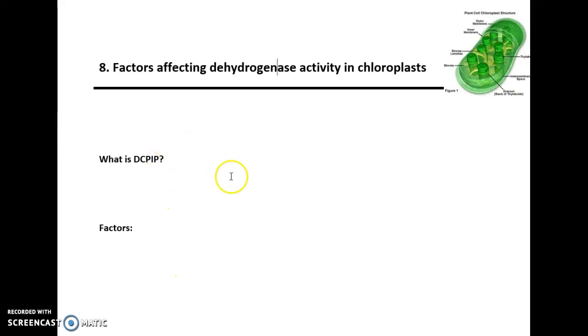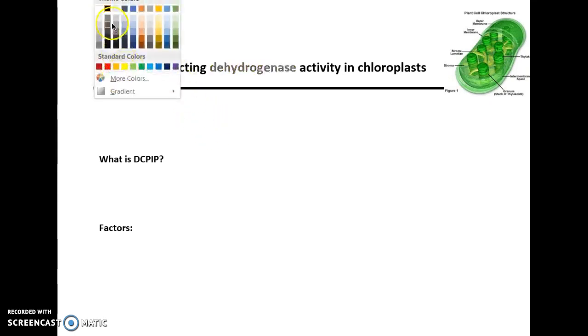Hello and welcome to TeachingBio. Today we're going to look at the 8th required practical for AQA A-level biology, and that is the effect of certain factors on the rate of dehydrogenase activity.